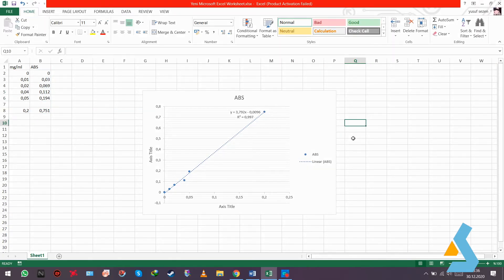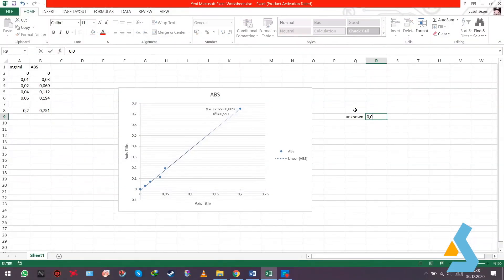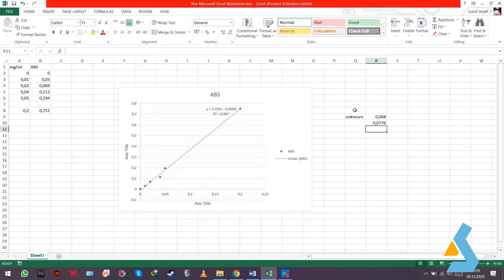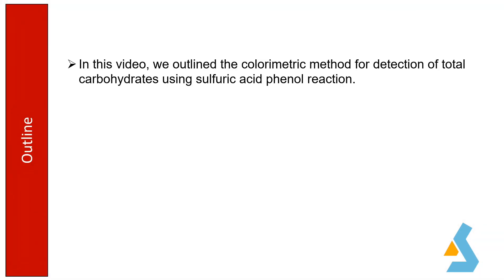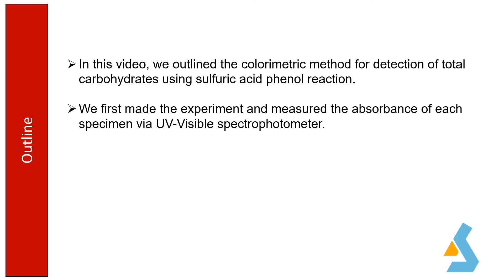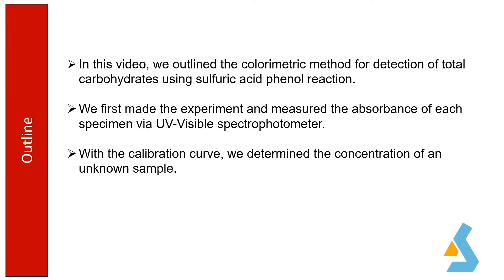The x-values are mg per milliliter of each specimen, while the y-axis defines absorbance. When we take the absorbance of the unknown specimen as the y-value, we obtain the x-value as 0.02 mg per milliliter, which is the concentration of the unknown specimen. In this video, we outlined the colorimetric method for detection of total carbohydrates using the sulfuric acid phenol reaction, measured absorbance via UV-Vis spectrophotometer, and used the calibration curve to determine the concentration of the unknown sample.